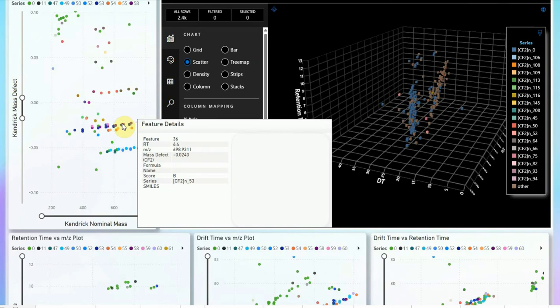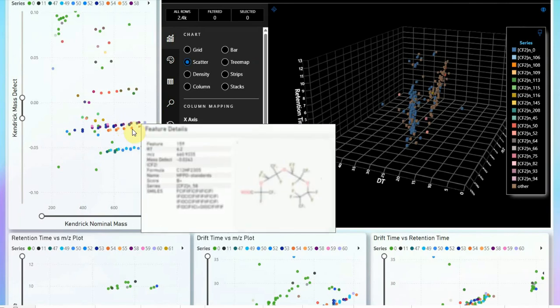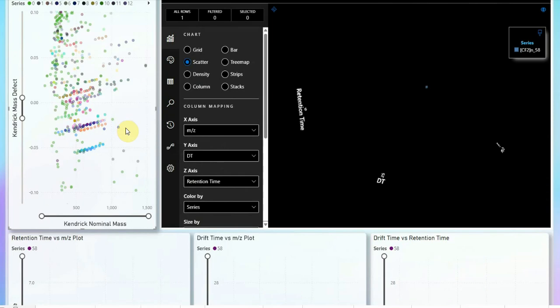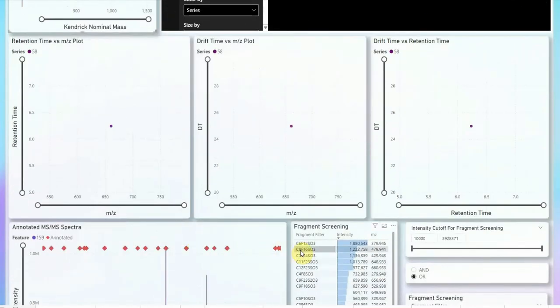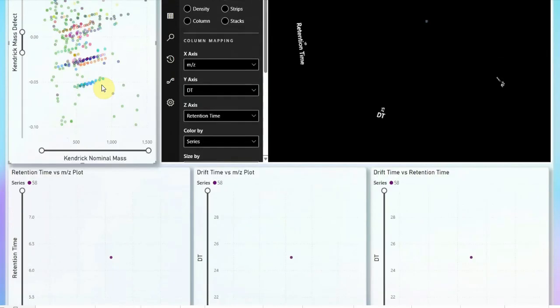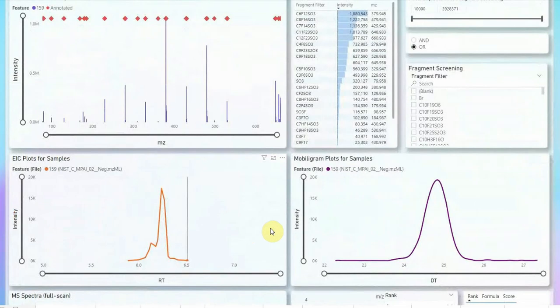And we can go into them and try to find some of them. So here's an interesting species. This is a B+, which looks like it has a bunch of sulfonic acid related fragments, and it does have the ether fragments. So we saw that the structure looked like an ether-related species, and indeed it does have these ether-like fragments.